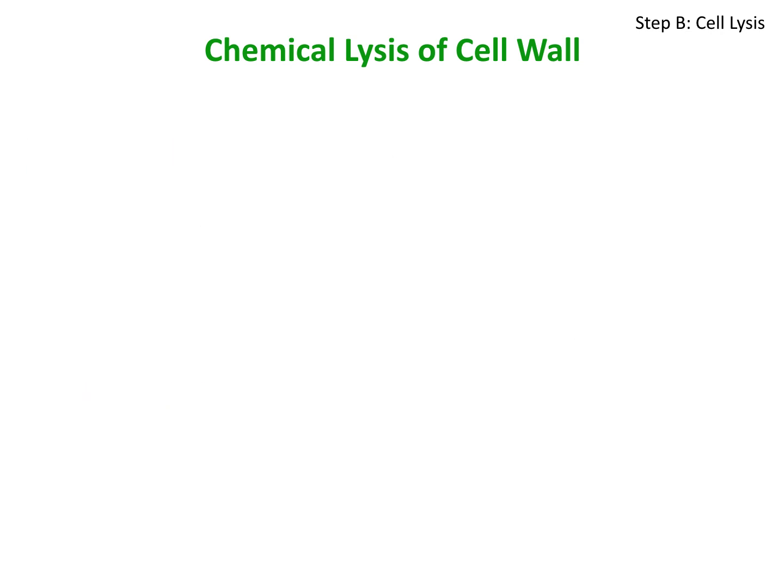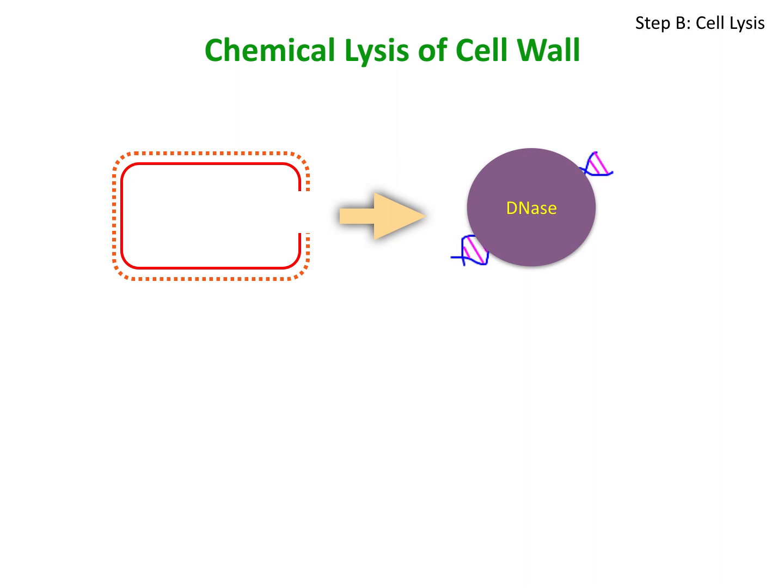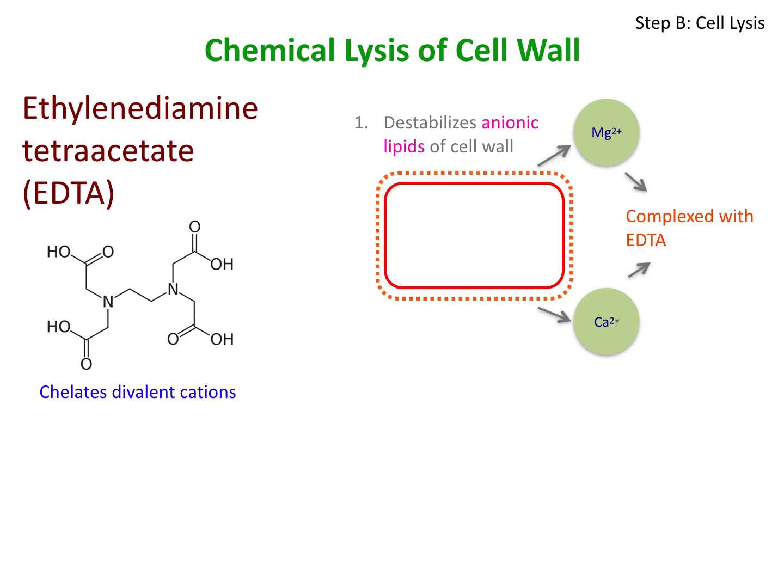In these cellular components, the cell's DNA is present, but along with this, DNases are also present. The DNA degrading enzymes about which I told you earlier as well. Now, this is a problematic situation because our aim is to extract intact DNA molecules. The solution to this problem is that these DNases require cofactors in order to be functional.